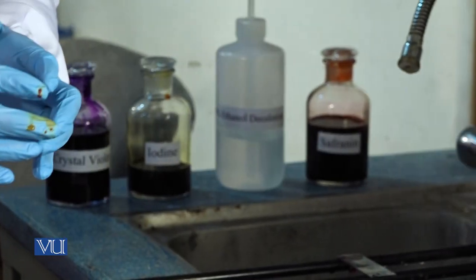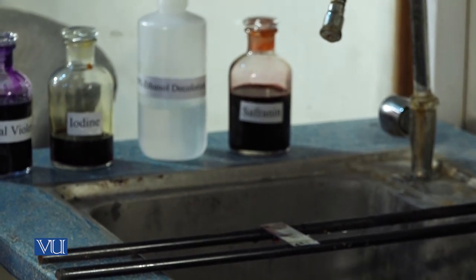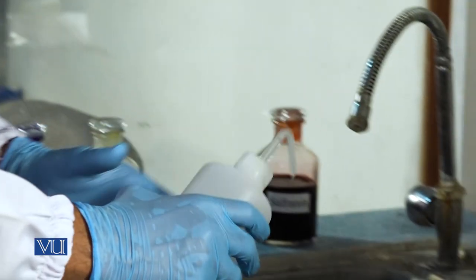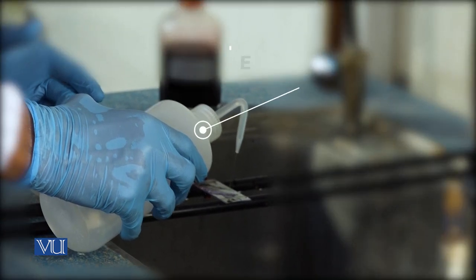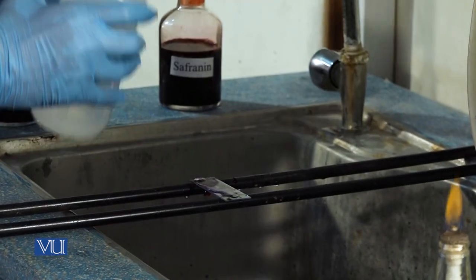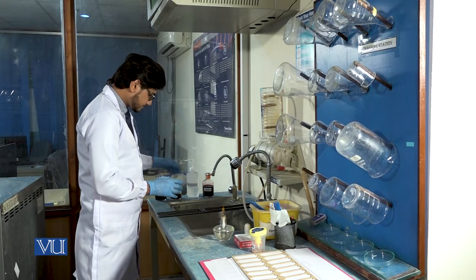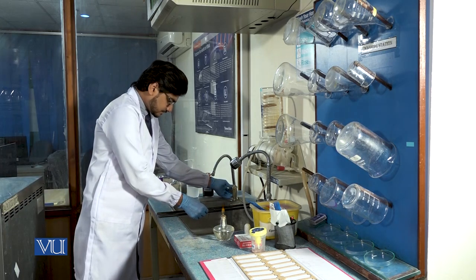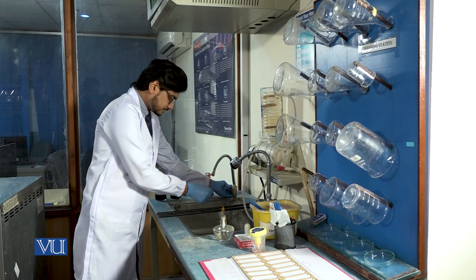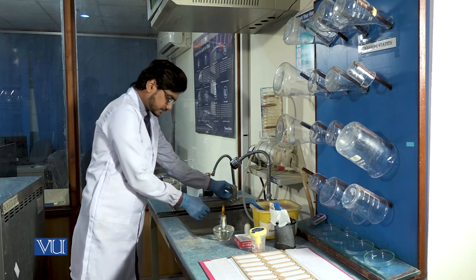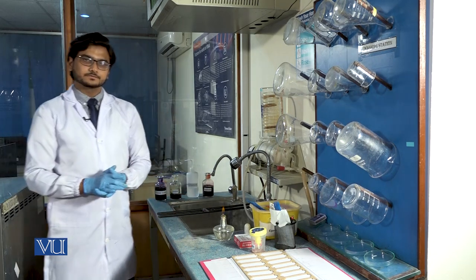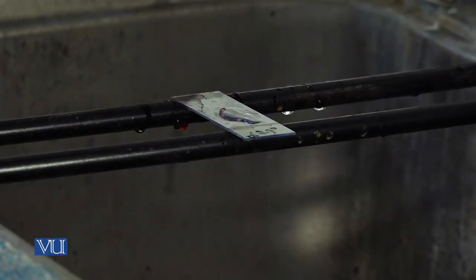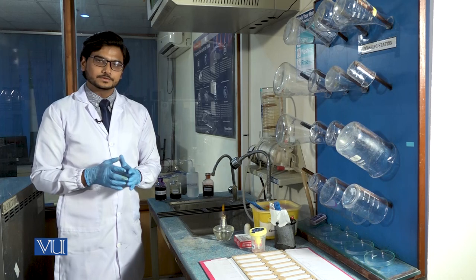Now we will apply ethanol as a decolorizer for 10 to 15 seconds. After 10 seconds, we again wash the glass slide with tap water.